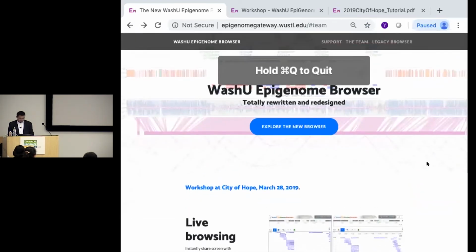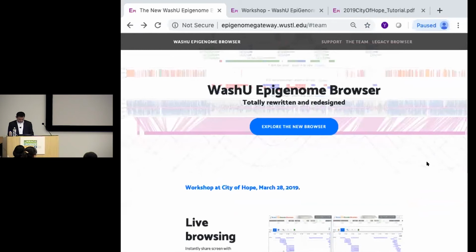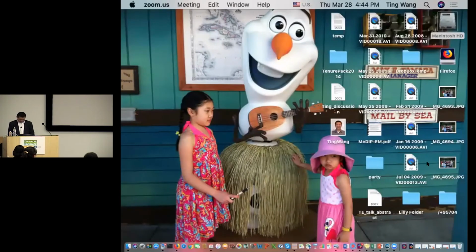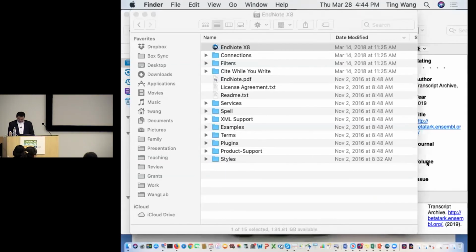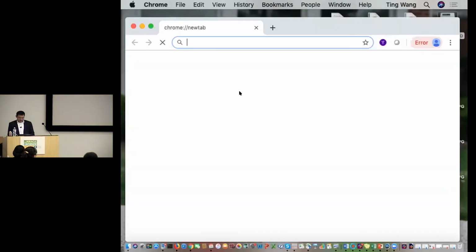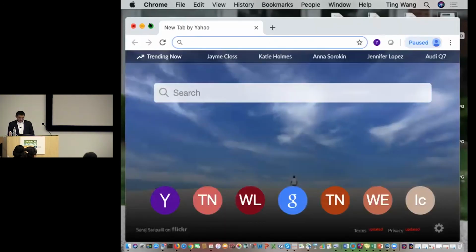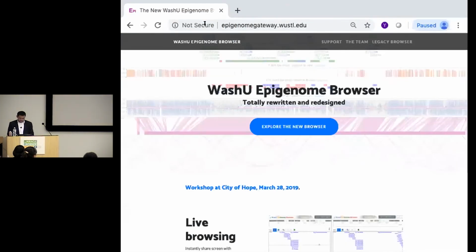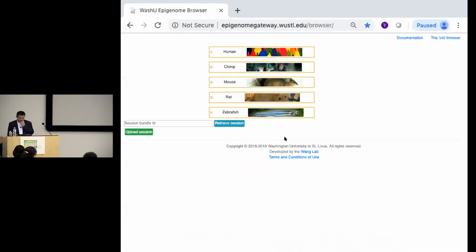Command Q. Hold. Oops. Where was I? Okay, let me do this again. Just get a clean start.